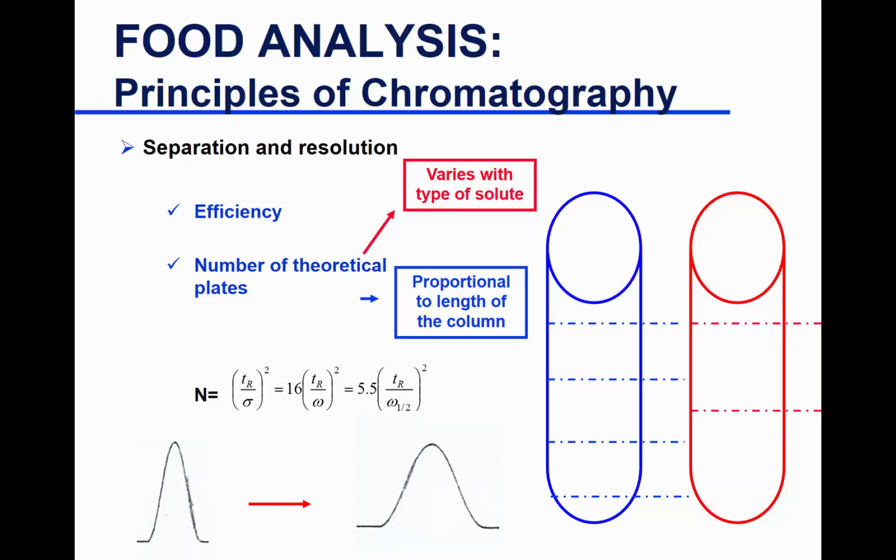Okay? So your number of theoretical plates, this is a theoretical plate, over time what happens to it? Decreases. So that's reduction in the efficiency of the column. You have the same compound, caffeine, you run in your column when it's new versus a year old, you start with this shape of a peak, you end up with this peak. Why? Because your sample now is spreading.